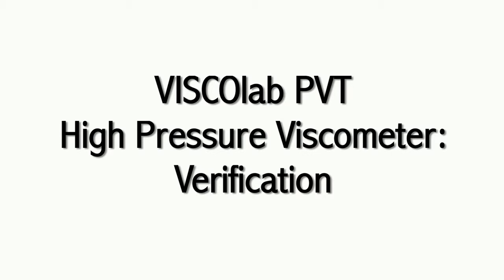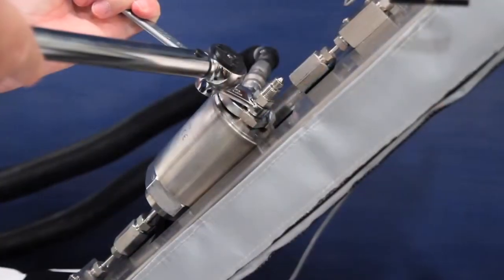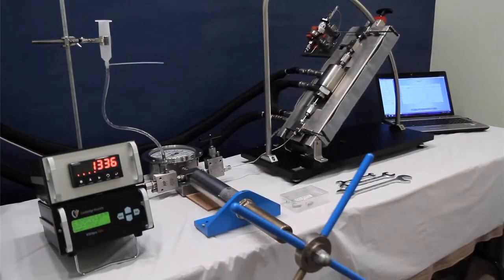The following video will show you how to test for leaks and measure a sample in your ViscoLab PVT system. It is recommended you watch our introductory PVT video if you are not familiar with the layout of the PVT system and the names of its parts. We will now begin to verify viscosity with our PVT system.